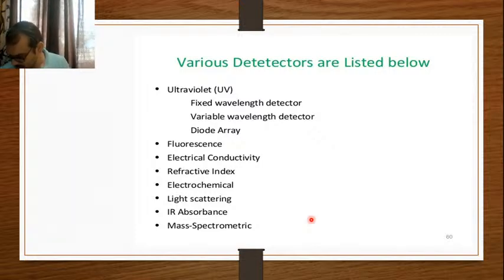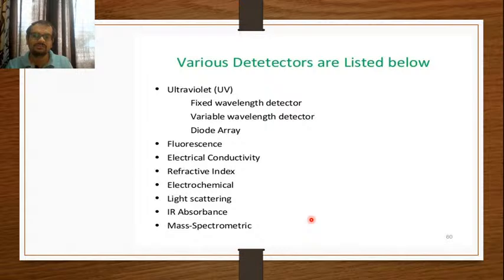Deepak says a separation method where the components are distributed between the two phases. Not getting exactly. What is the exact definition? Yes, good. Radhika says the solvent strength of the mobile phase is increased during the separation. That means there is variation with respect to the strength of the mobile phase. As I already told you in our earlier session also, yes, steady changes in the mobile phase composition during the chromatographic run. Excellent, Prakshep.